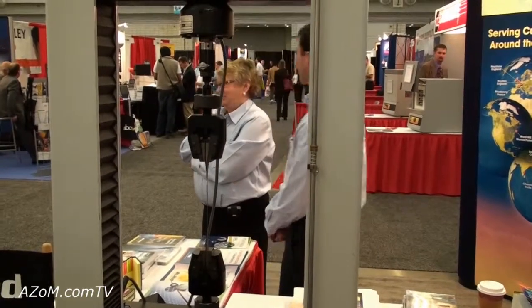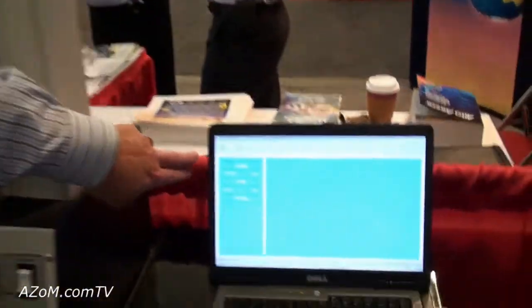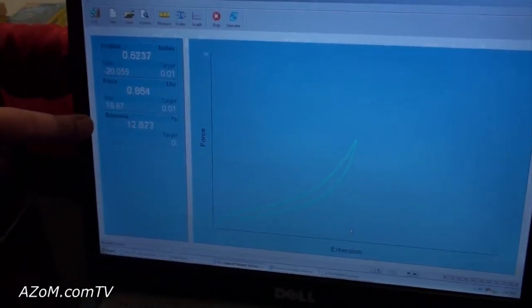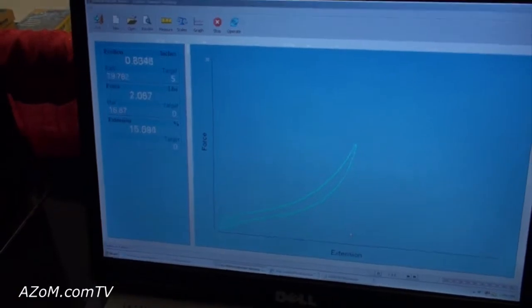Right now we're running at 20 inches a minute, but on this system we can run at 40 inches a minute max. You can see over here we're displaying the rate with the position. There's our force. Here's our actual extension, which we're using the cross head plus grip separation to figure out our total elongation.